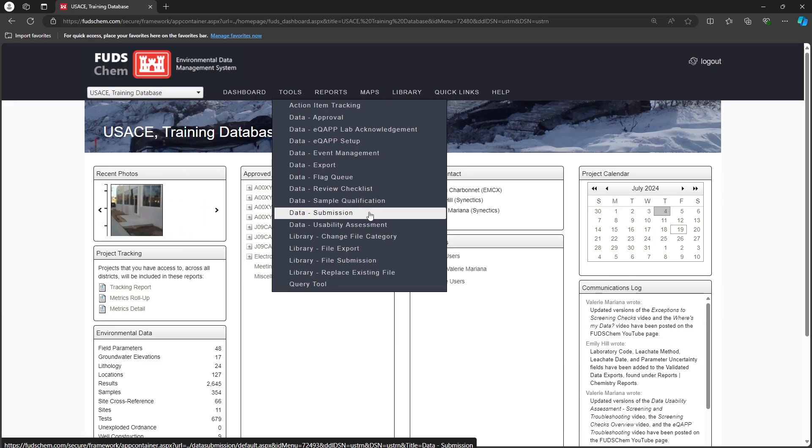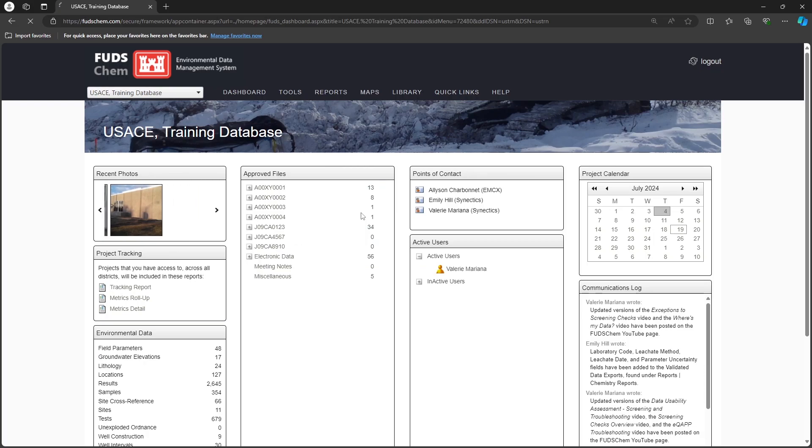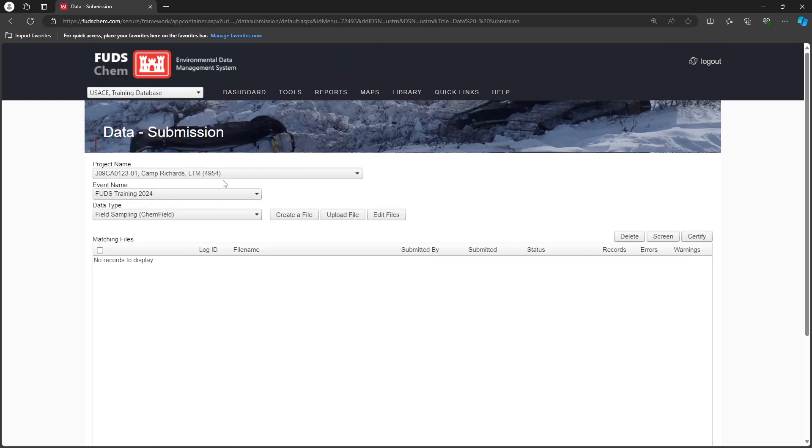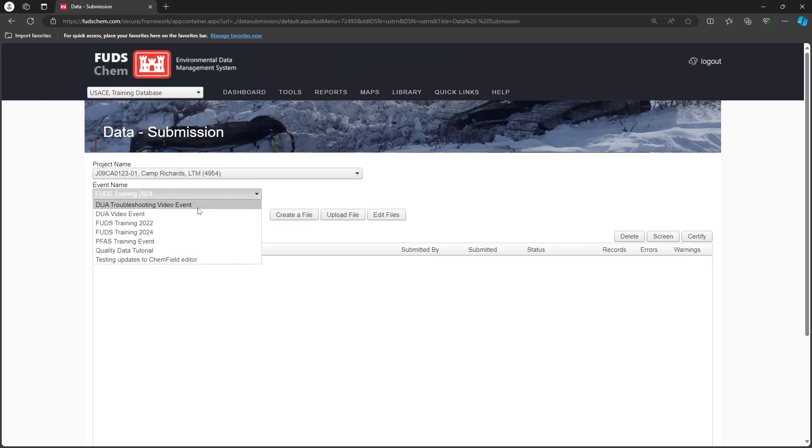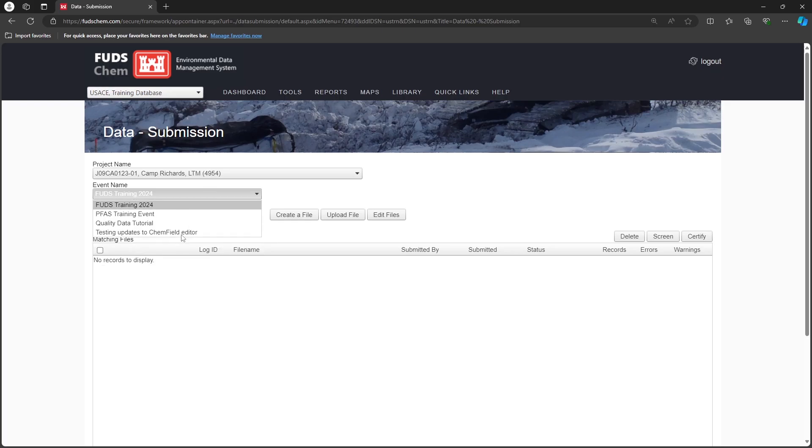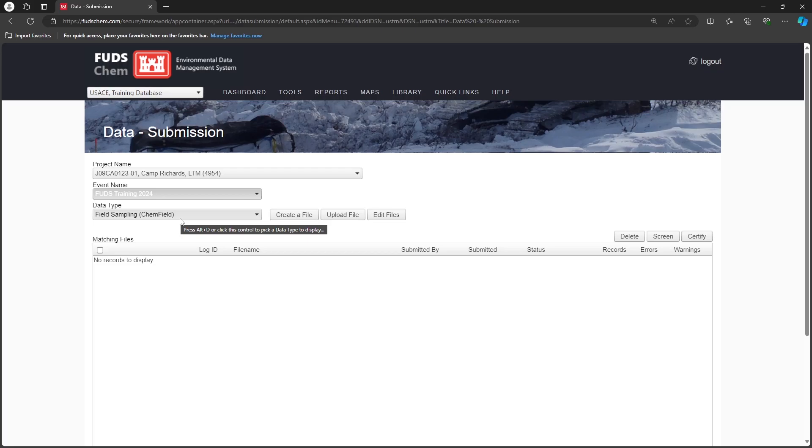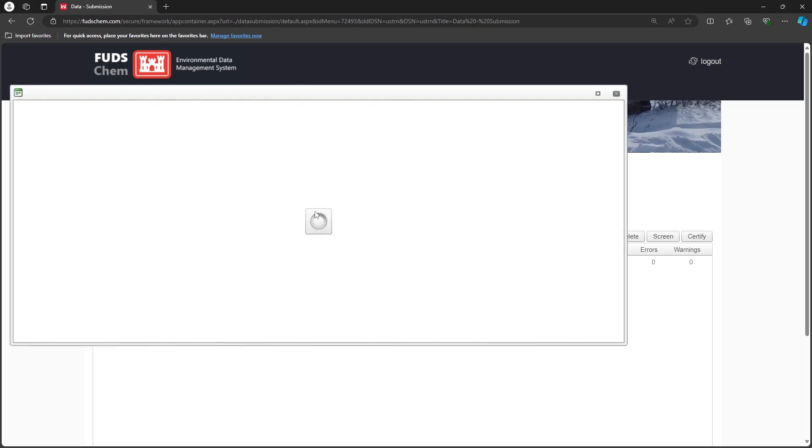Go to Tools, Data Submission. Choose the Project and Event. Choose Field Sampling CHEM field as the data type, and click Create a File.